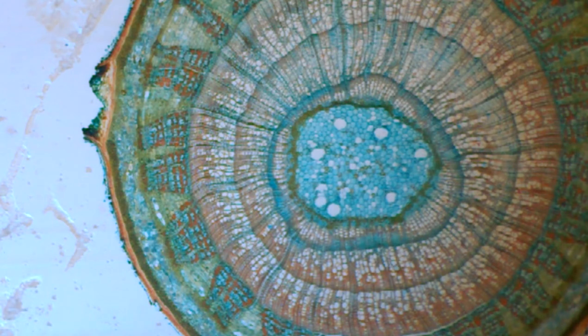This has been stained, so some parts are blue and some parts are red from the counter stain. Should we go into the other room to talk so we can watch you point?